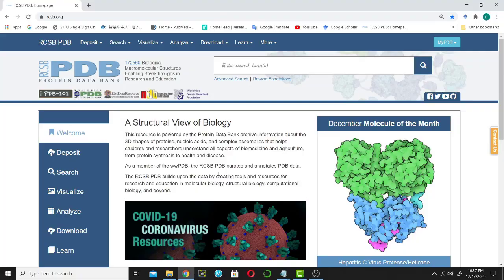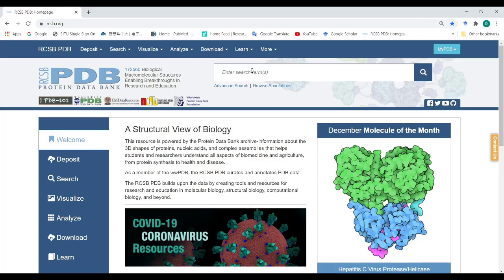This is the main page of the PDB data bank. The PDB data bank is a database of three-dimensional structural data of biological molecules such as proteins and nucleic acids. Here we will enter the name of the protein or the code of the protein — each protein is assigned a specific code.